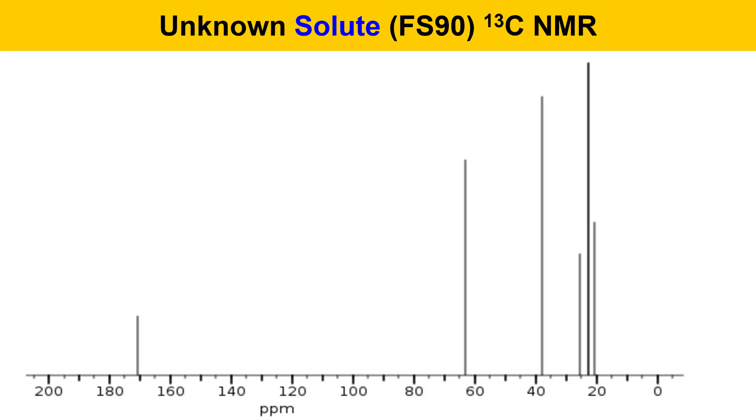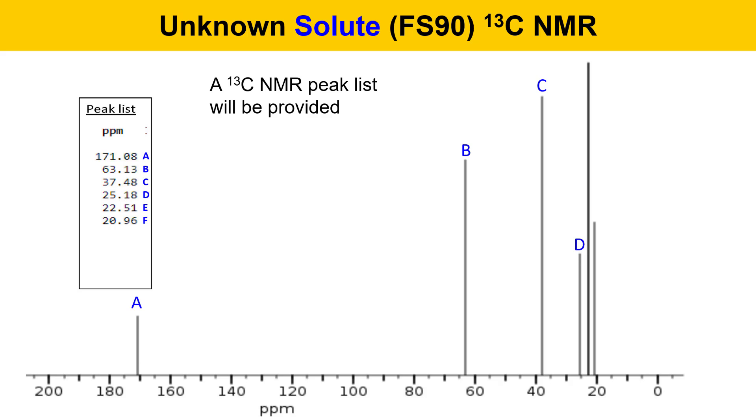Here's a carbon-13 NMR spectrum for the unknown solute FS90 that's featured in these demonstration videos for this experiment. A carbon NMR peak list will be provided. Here it is for this spectrum, where there are peaks I've labeled A through F. This is important for carbon-13 NMR spectra, where the peaks are very close together and it's hard to tell how many there are. You'll be able to look at the peak list and know for sure. Your carbon-13 NMR spectrum for your unknown solute will be organized similarly with a peak list. I'll label these peaks with capital letters in a way that's analogous to the way I labeled the proton NMR spectrum. When you figure out the structure of your unknown solute, you'll draw its structure and then draw capital A, B, C, and so on next to each one of the carbons to identify it and assign it.